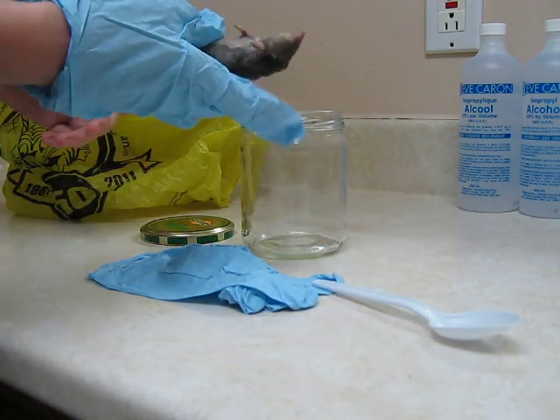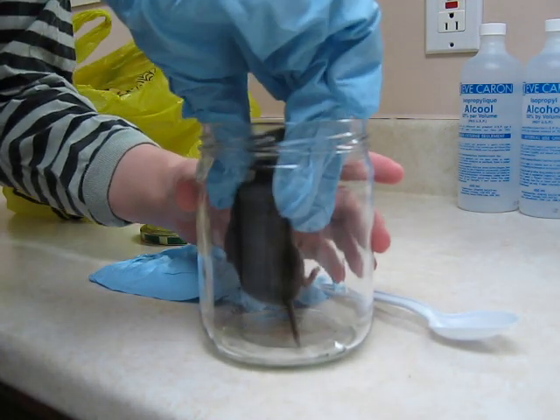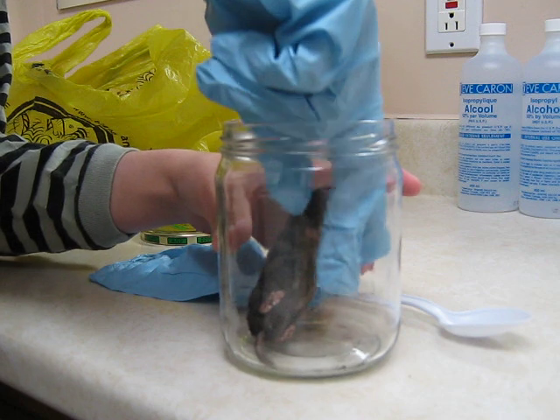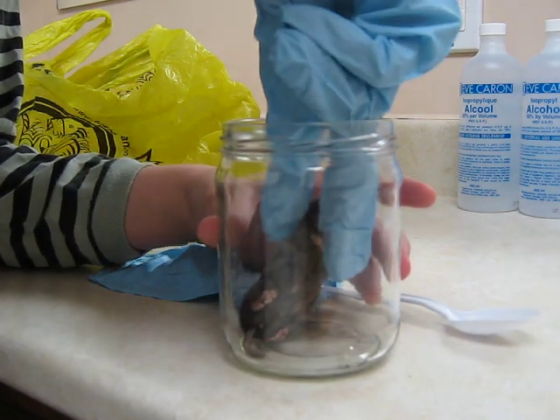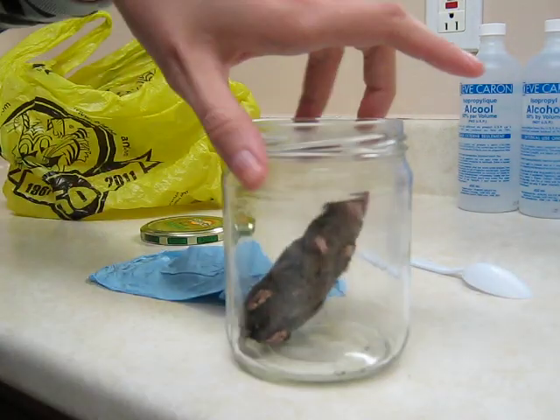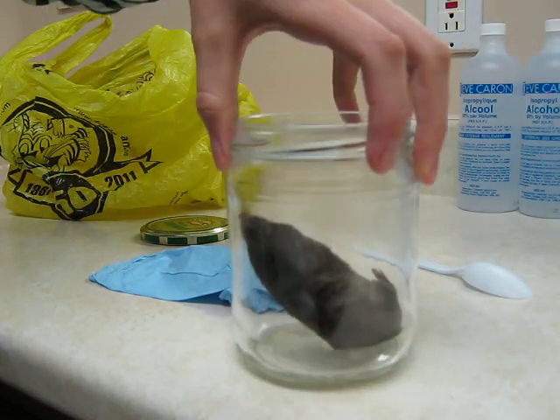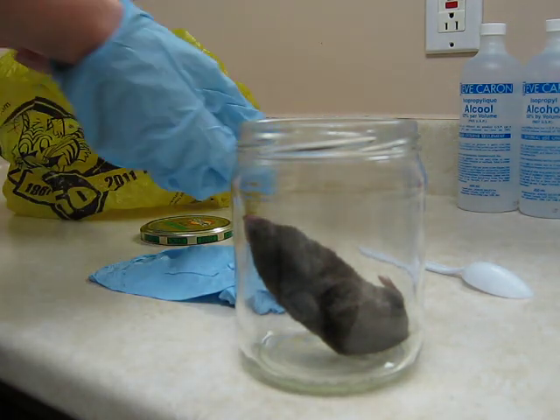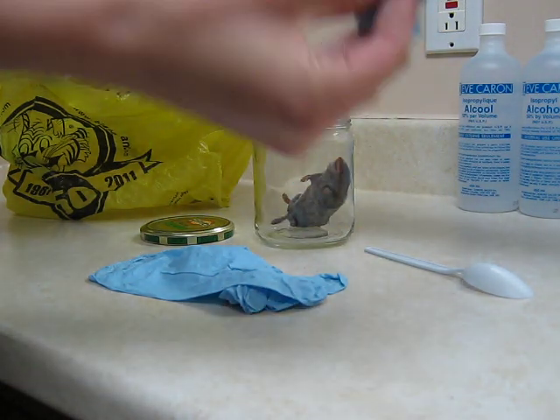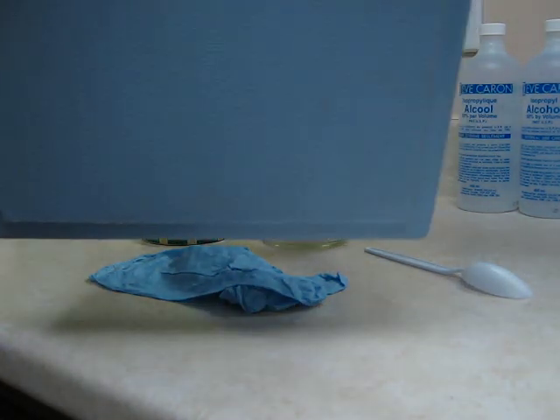I'll just position him as best I can — hopefully you guys can see this. Just like that. I'll probably use the spoon to reposition him later. Actually, I think that's okay. He'll probably reposition himself once he gets a little less frozen. I'm going to take the glove off, turn it inside out so I'm not touching anything, and put it in the trash. Don't touch it — just put it right in the trash.